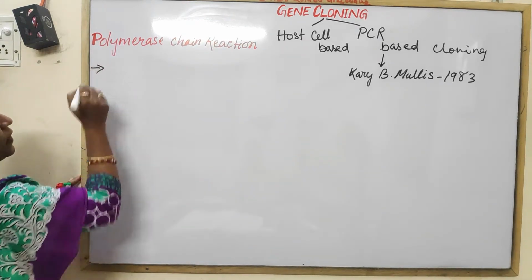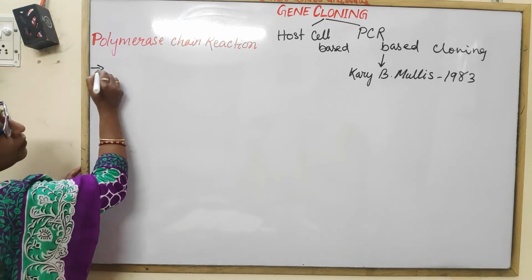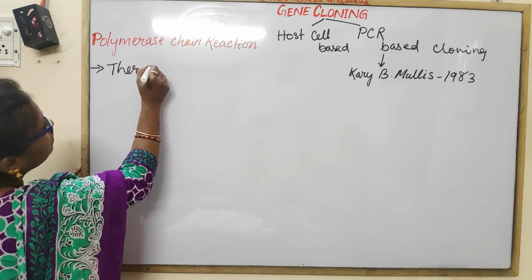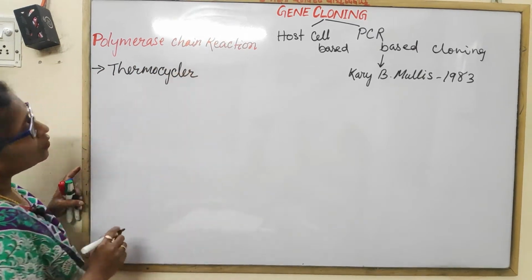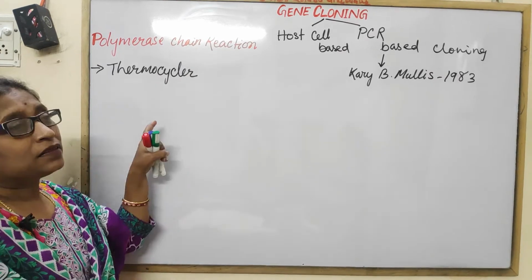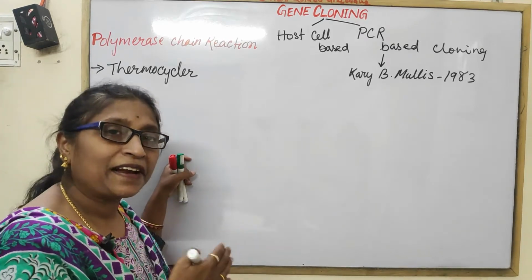In this technique, the thermocycler is used. The thermocycler is the device within which the reaction is carried out.